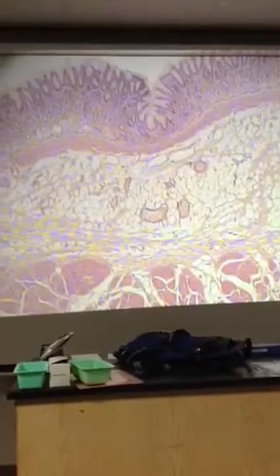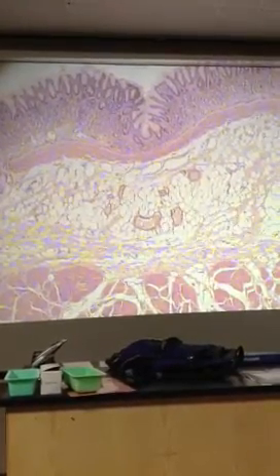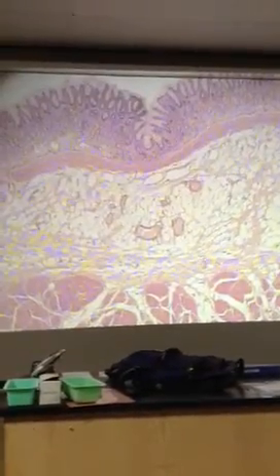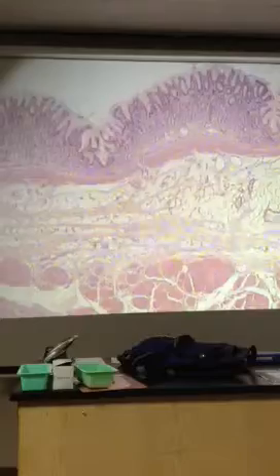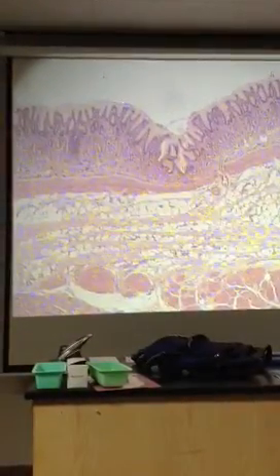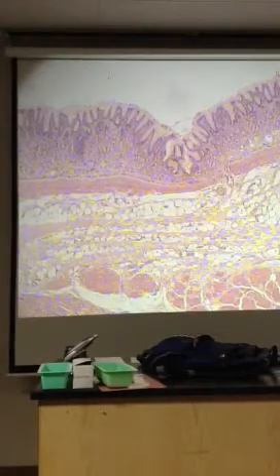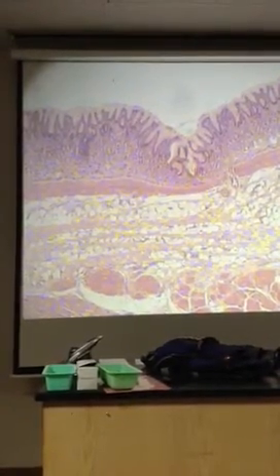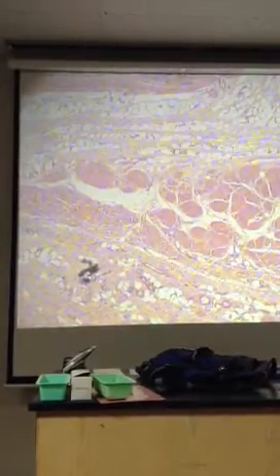There's a lot of adipose in our slide of the stomach in the submucosa. I'm not sure why, that's pretty atypical, but I guess it can help you identify it for our purposes. Okay, and so this main layer, here's our innermost main layer, from here to here is what? The mucosa. Mucosa, good. Let's do the big picture first. Submucosa, main layer.